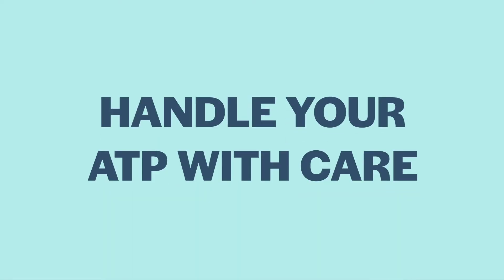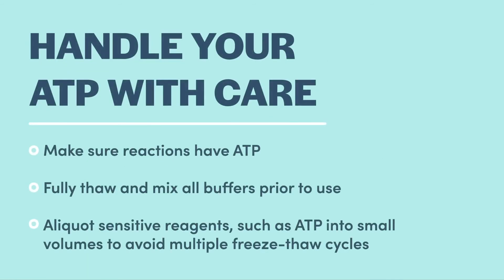ATP is critical for your ligation to succeed. Some manufacturers include ATP in their buffer concentrates; others provide the ATP as a separate reagent. ATP has low solubility, so make sure that your reaction buffer concentrate or ATP stock is fully thawed and mixed. Avoid the temptation to heat the reaction buffer or the ATP to speed its thawing, as this can actually degrade the ATP. Multiple freeze-thaw cycles can also degrade the ATP, so aliquot your reaction buffer concentrate or ATP concentrate prior to first use.